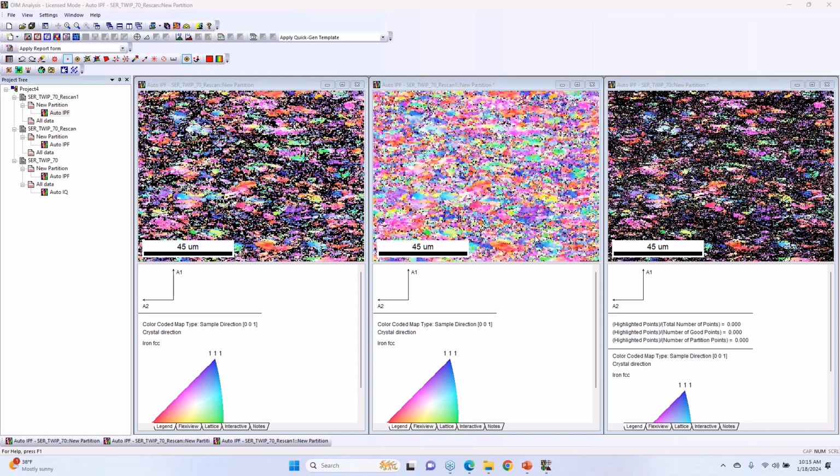A lot of chemical etching will introduce some amount of surface topography. I've shown tools that can address that, but if you can avoid it, you're better off. And in the end, with ion etching, you have more control over parameters. Sample size is more of an issue, but for most metallographic mounts, 1 1/4 inch mounts, ion etching is going to do a pretty reasonable job.